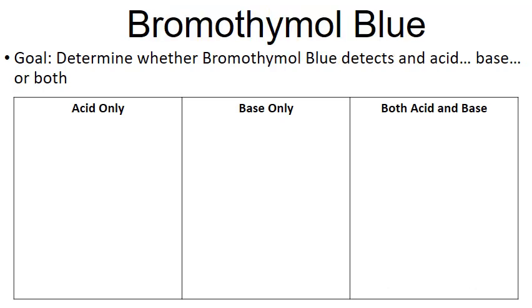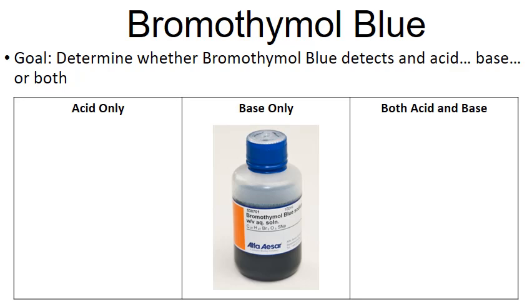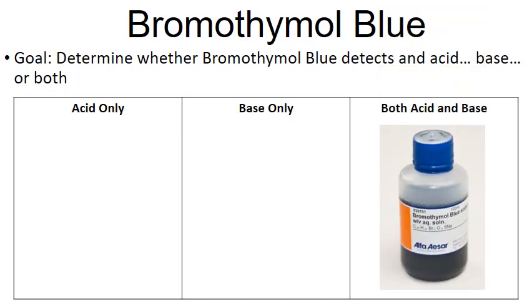And finally, bromothymol blue. Will bromothymol blue detect if a solution is an acid? Or can you use bromothymol blue to detect if a solution is a base? Or can you use bromothymol blue to detect both an acid and a base? So these are going to be your tasks that you have in our activity in class.